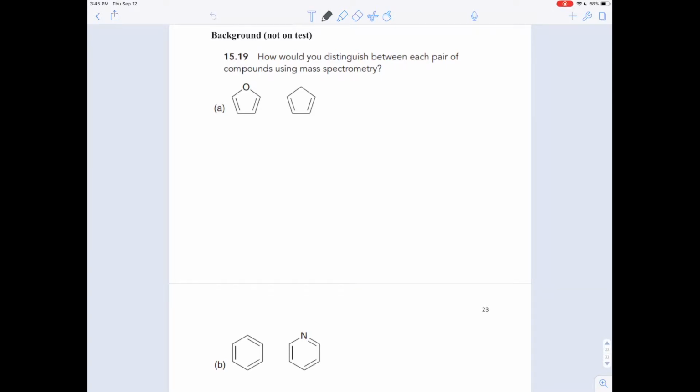So mass spectrometry is a way to measure, that's what the metry is referring to. For example, the metric system is a system of measurement, so this metry is a way to measure the mass of a compound. And what you're going to do is you're going to get a bunch of different masses that will spread out in a spectrum when you use this technique of mass spectrometry.